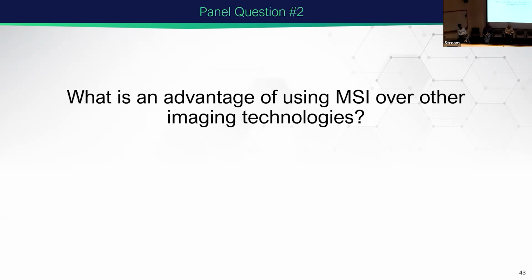So same question to you, John. What do you think the biggest disadvantages of, say, NanoSIMS and anything in between? Well, all of them, it's dollar signs. Yeah. The cost, there's a $17 million magnet down there, and that doesn't even include the sample introduction units or the amount of data that comes out. It's got a really big price tag attached to it. A new NanoSIMS today, I asked yesterday what it would be. Still don't know, but $8 or $10 million.